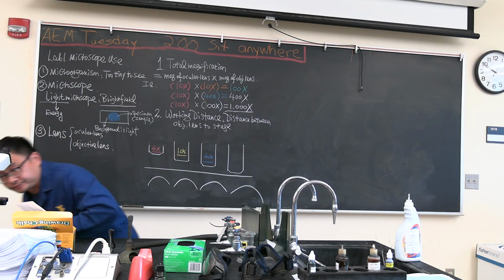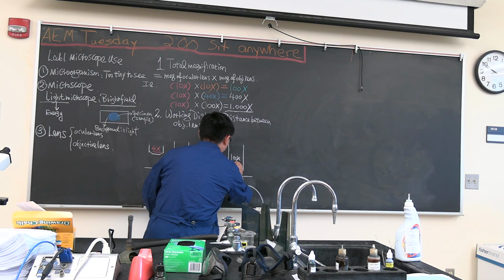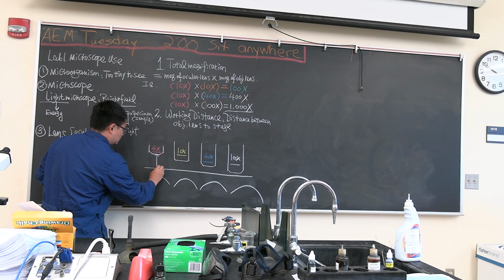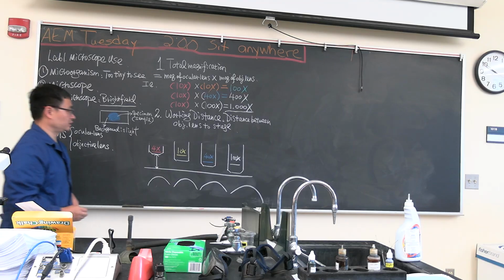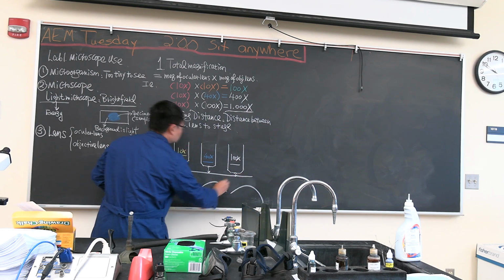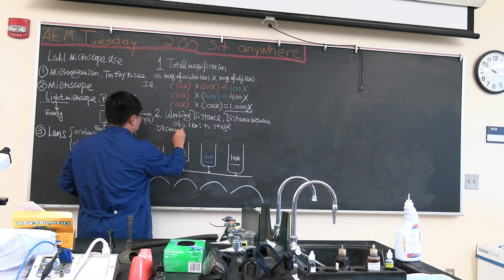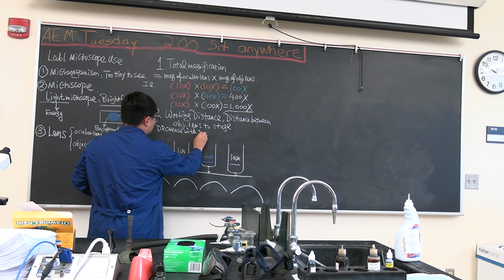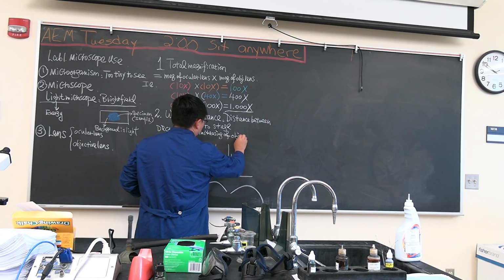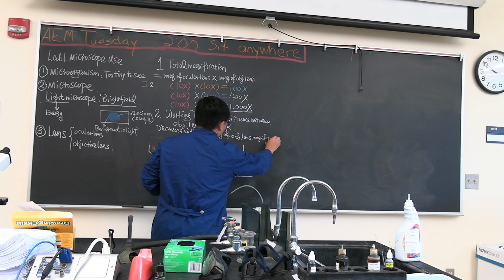Let's see the color, what it looks like. Should be white one. 100x. So what's the working distance? The distance between the objective lens and the stage is called working distance. You see it? The working distance decreases with increasing of objective lens magnification.